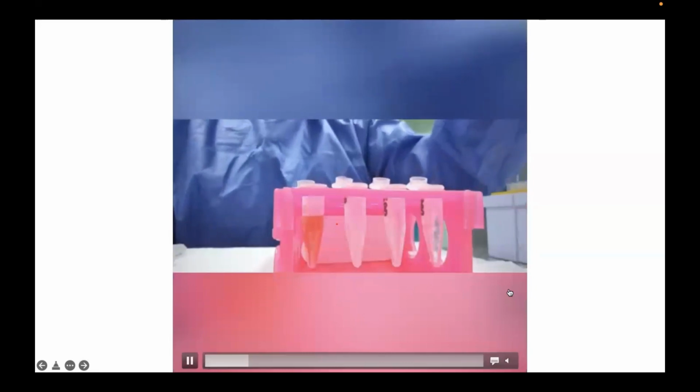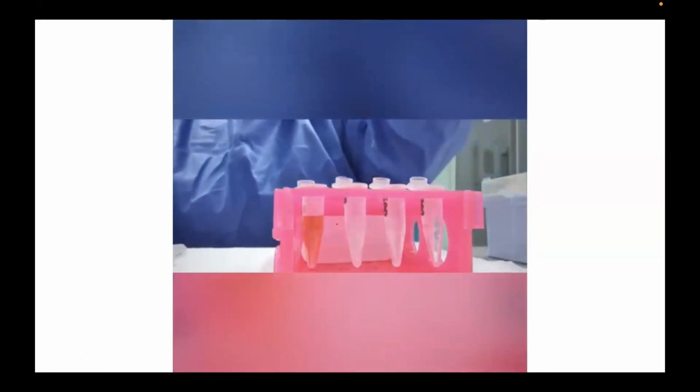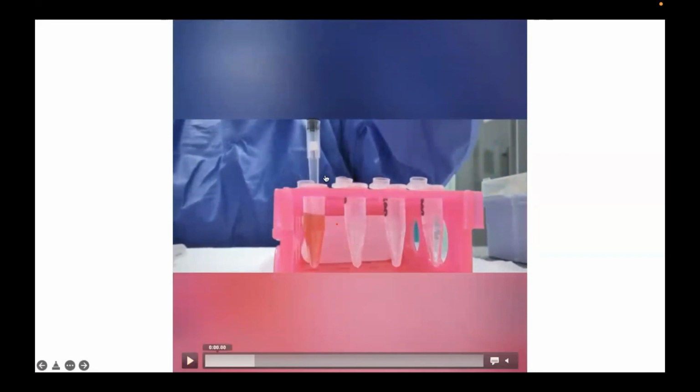So different yung volumes natin, different pipette tips yung gagamitin, and different pipette. So ayan. Kung napapansin po, ang ating pipette tip, meron siyang filter. Ito yung tinatawag natin na filter tips. Okay, so ang ginagamit po ito sa mga COVID-19 testing laboratory para po ma-prevent yung pag-produce ng aerosol. May filter siya dyan. So kung napapansin ninyo, nung nag-a-aspirate pa lang tayo, naka 90 degrees, vertical angle.